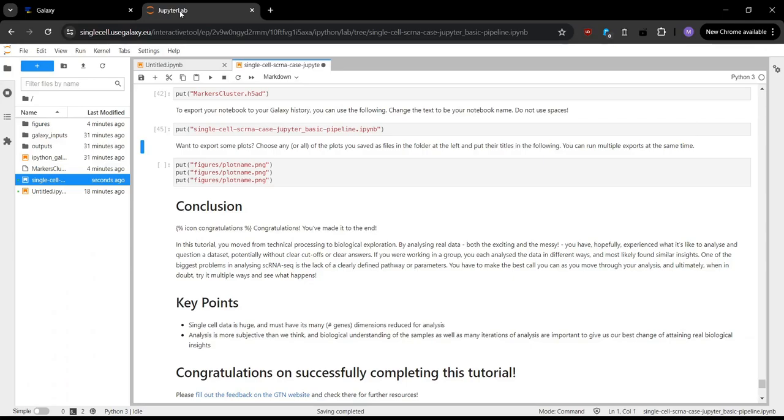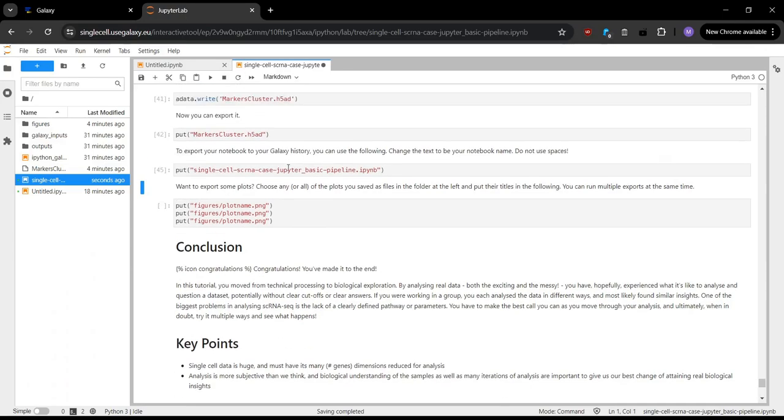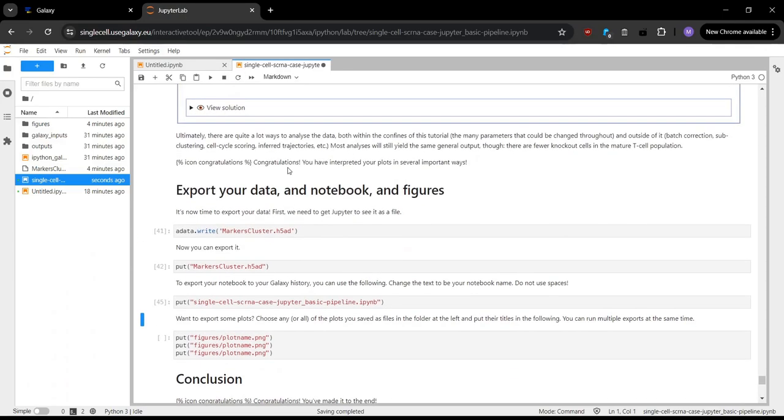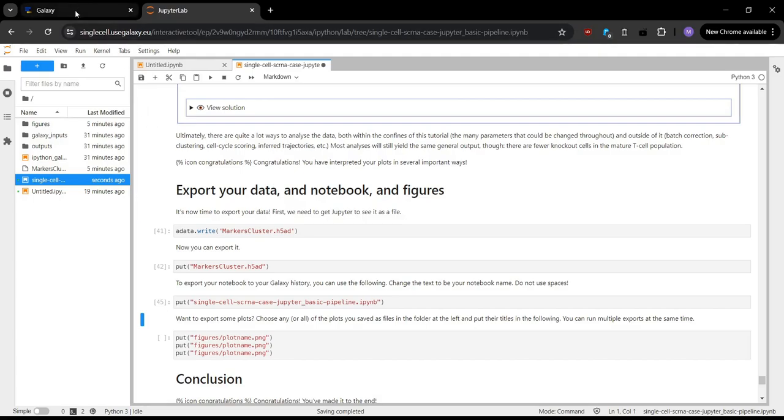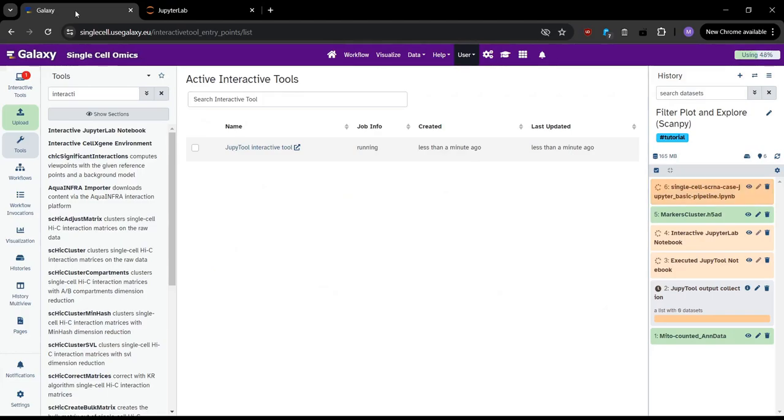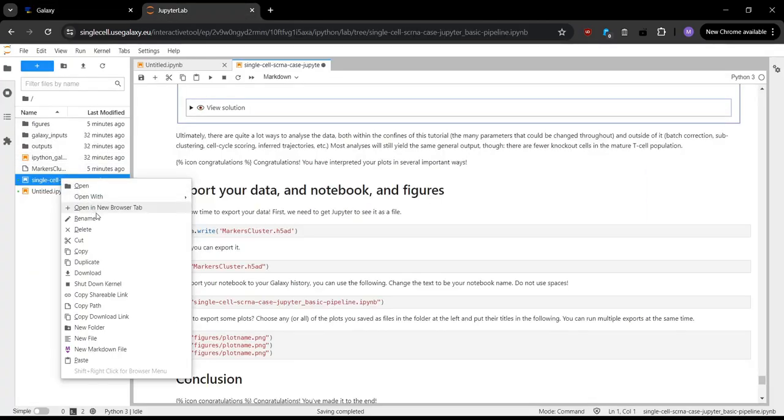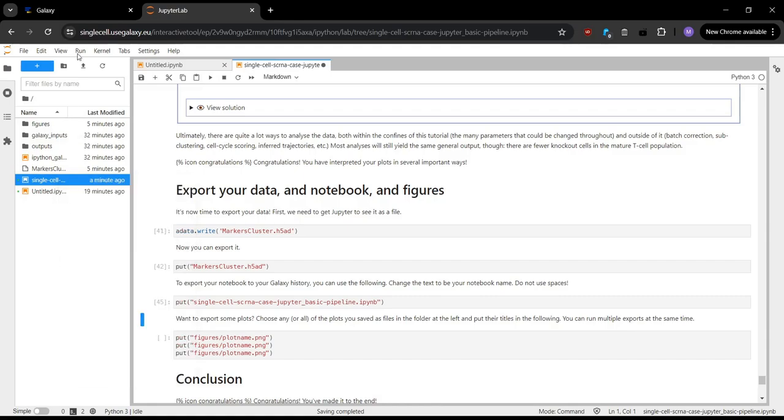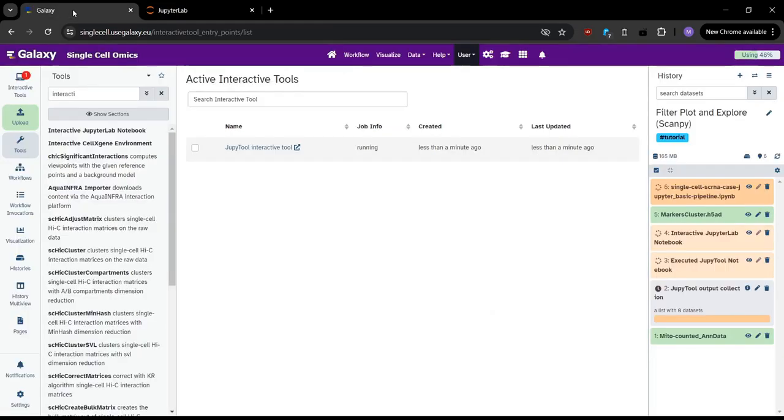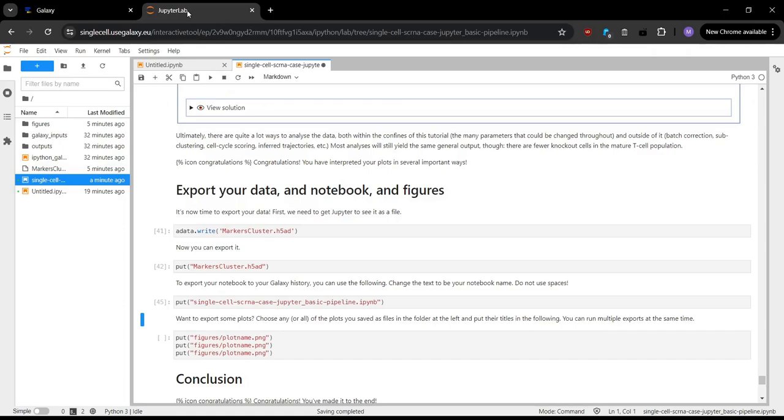Basically, the importance of doing this is that once JupyterLab is closed, all this data we have here is lost. So it's really important that every time we run stuff, any sort of data, or the notebook, or any images, which we'll show in a second, once we get that data, we want to make sure we either save it locally, because you can actually click on this and click download, or we want to make sure it's saved into Galaxy using the put command.